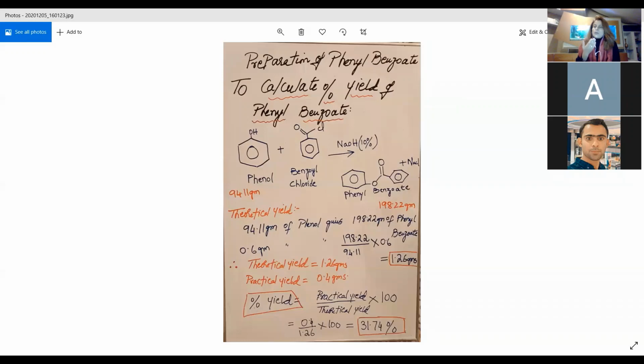Simple. But if you do not get it in this way, then you give it a boil. You will dissolve it, and you will filter it off on the spot, and then you have to wait for the filtrate, what is left at the bottom, right? That is the filtrate you are going to keep, and you are going to reduce the volume. You have to keep it for a while and check whether your precipitates are there or not.